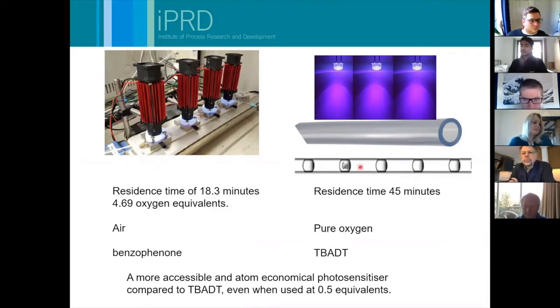And that's contrasted with photochemistry within the tubular system. So if you were doing a gas-liquid reaction like we're doing here, and this is an example of what would happen, you would have slugs of gas, slugs of liquid, slugs of gas, and then your light intensity will be highest nearest the top of the tube. So there are really good advantages to doing photochemistry within CSTR systems, okay?